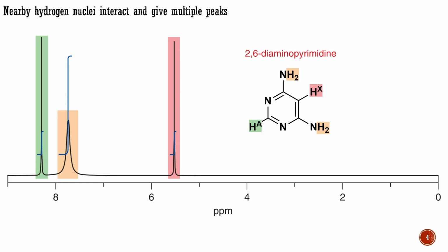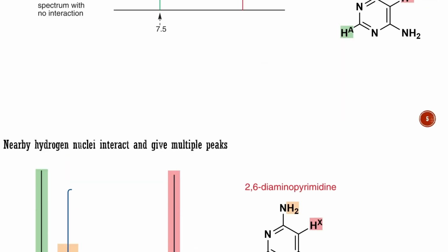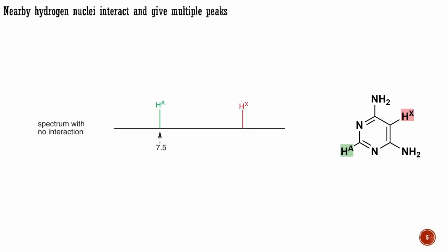Understanding this phenomenon is so important that I am going to explain it in 3 different ways. You choose which appeals to you most as each method offers a different insight. The diaminopyrimidine spectrum you have just seen has 2 single lines because each proton in the ring can be aligned either with or against the applied magnetic field. From now on we shall call such signals singlets.